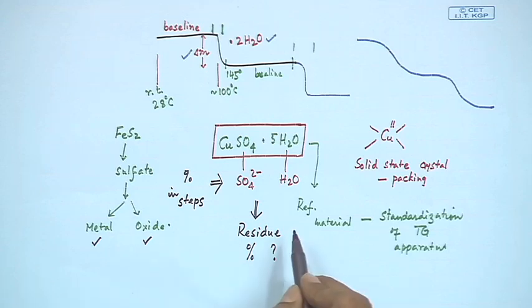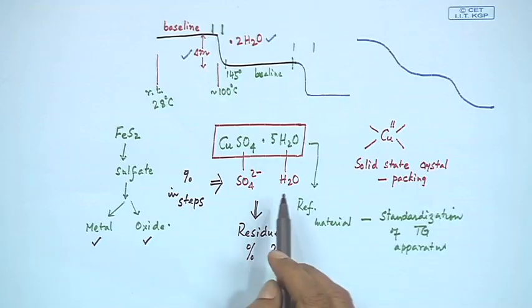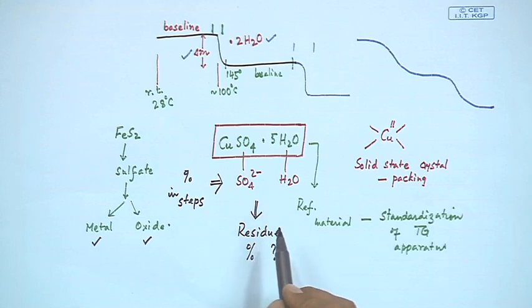So, in our next class we will see how we can analyze and how we can quantify basically the corresponding thermal degradation of a pure copper sulfate pentahydrate sample. Okay, thank you very much.